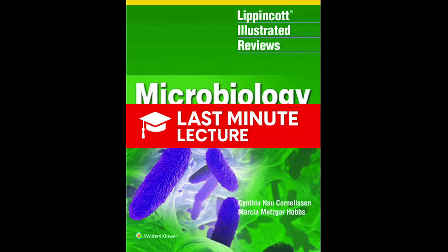The book also mentions the India ink prep for fungi. That sounded visually pretty cool. It is. It's for Cryptococcus neoformans. This fungus has a huge, slimy capsule around it. The India ink particles are too big to get through it. So it creates a halo. A perfect, clear halo around the yeast cell. It's like a force field. It's instantly diagnostic. Okay, so microscopy gives us a shape and a color.